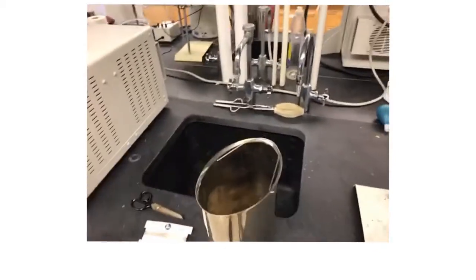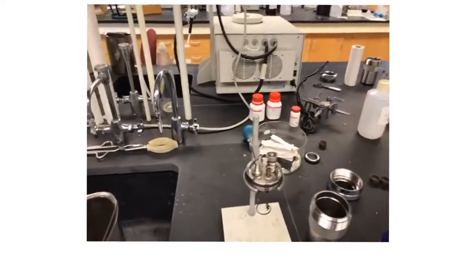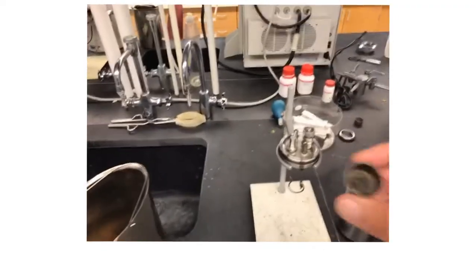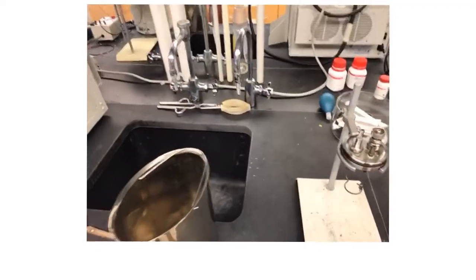What we would do is take our crucible. Usually we'd want to wear gloves. We'd want to make sure this is good and clean. Rinse it out with water, maybe soap, dry it out, rinse it with some acetone. Wipe it out real good with a chem wipe in between trials. You'll see some soot forms on the inside.